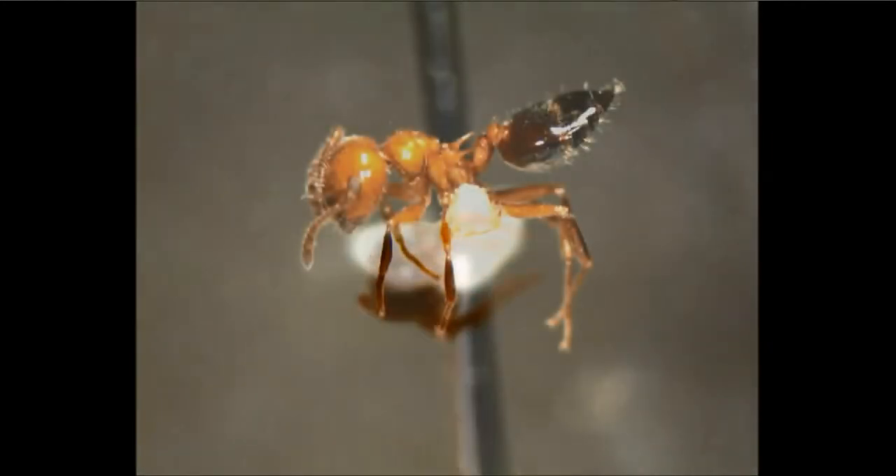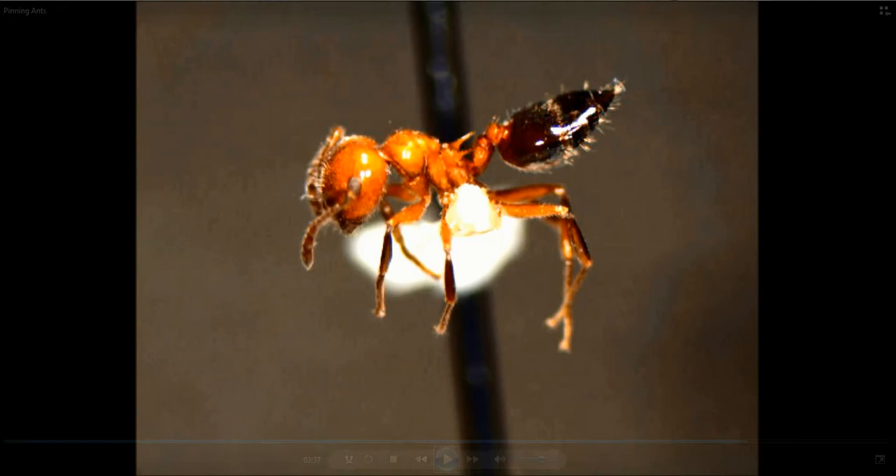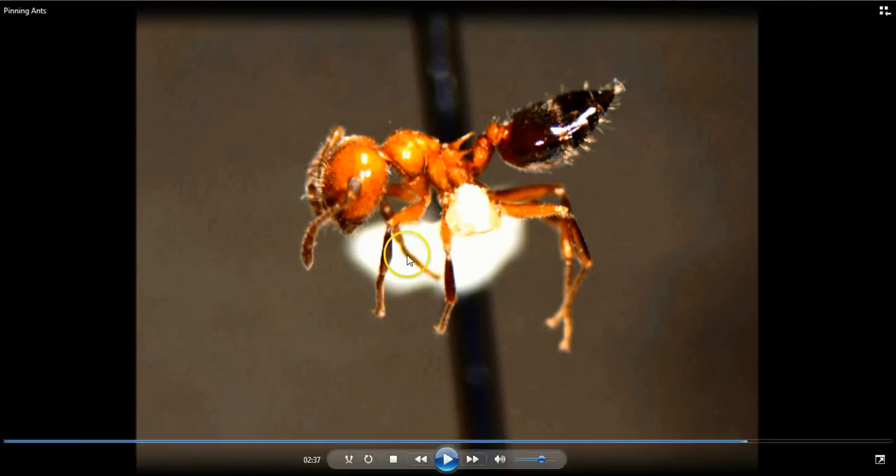Let's go ahead and show you the point being glued in now. By the way, it's kind of a large blob of glue there, but as long as you're underneath the ant, you can use a little bit of extra glue and it won't obscure any of the parts we want to see. Now I'm going to check the position on the side and make sure it's flat — and it's good. Don't expect perfection. The main thing is we want the head, the mesosoma, and the gaster to be visible. In this particular case I put the point between the second and third pair of legs instead of the first, but it doesn't even make any difference because this ant is firmly glued in place, and that's what we really want.